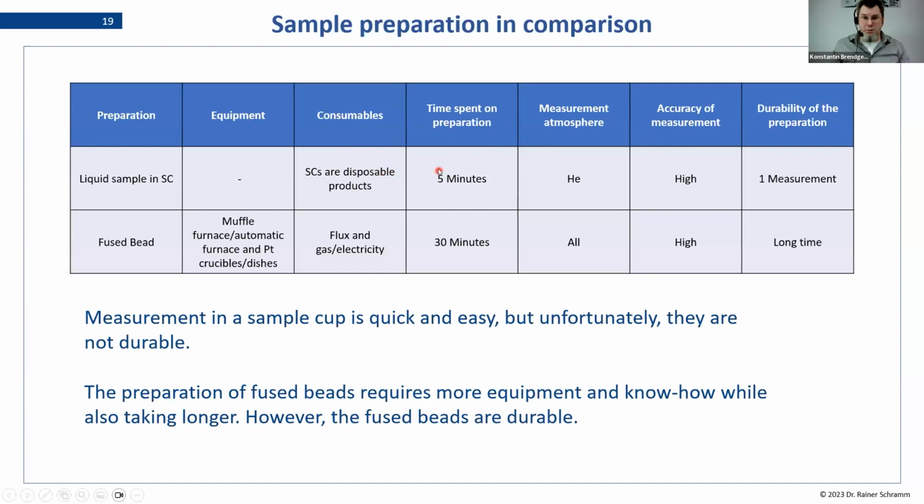It is very quick in terms of preparation here. The measurement of the method is a fixed time that we have to invest, and it depends heavily on the number of analytes and so on. But preparing a sample cup for measurement takes less than 5 minutes.